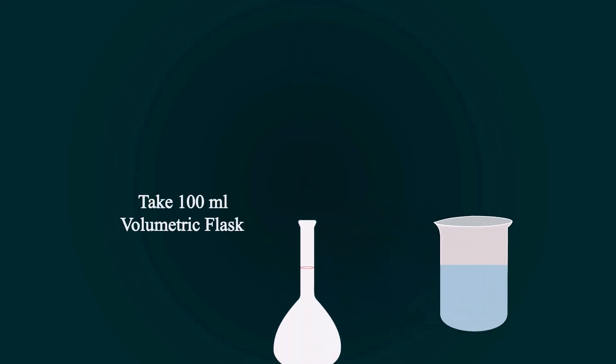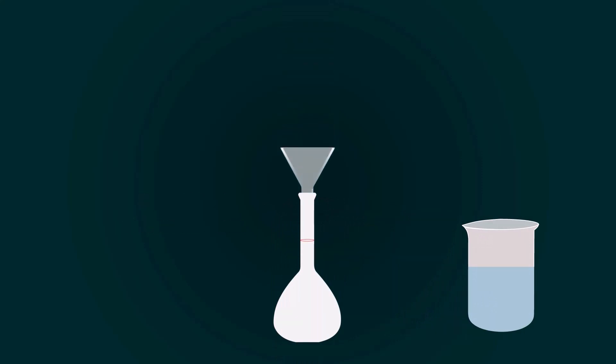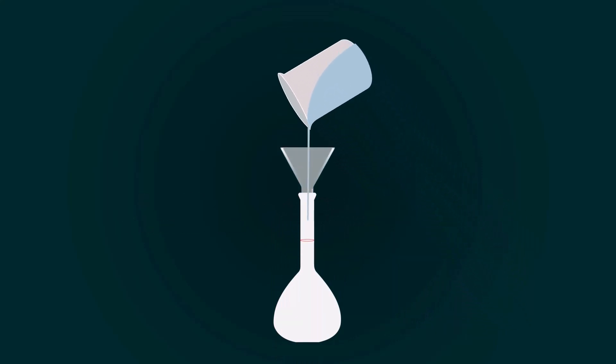Now take a volumetric flask of 100 ml and put a funnel on the top of the flask. Pour all the solution into the volumetric flask. You have to fill it up to the 100 ml mark.